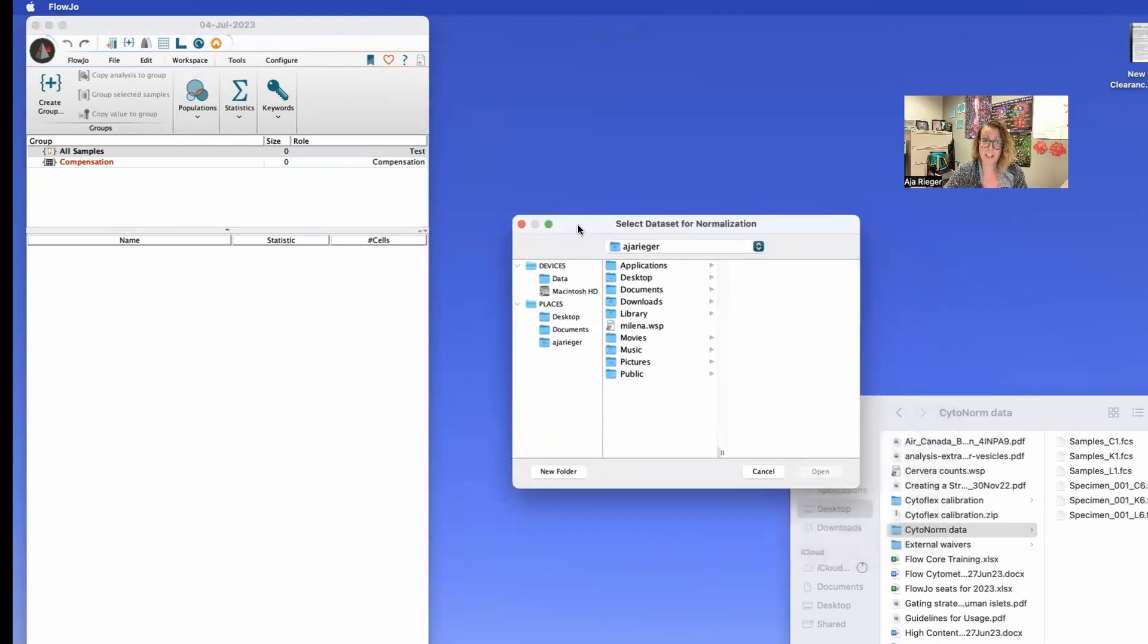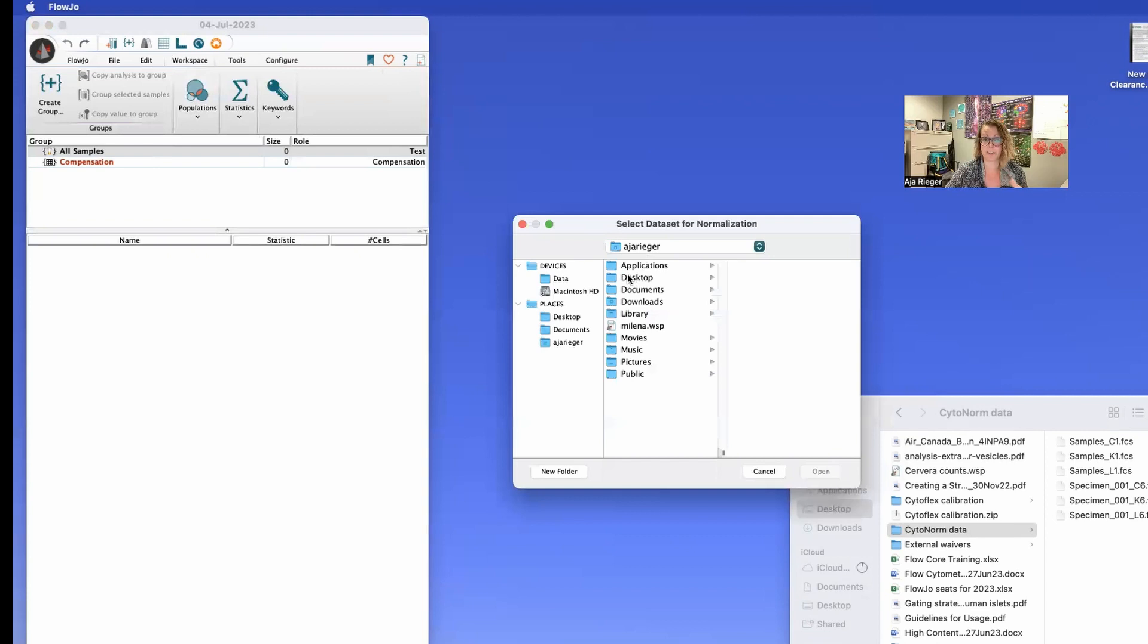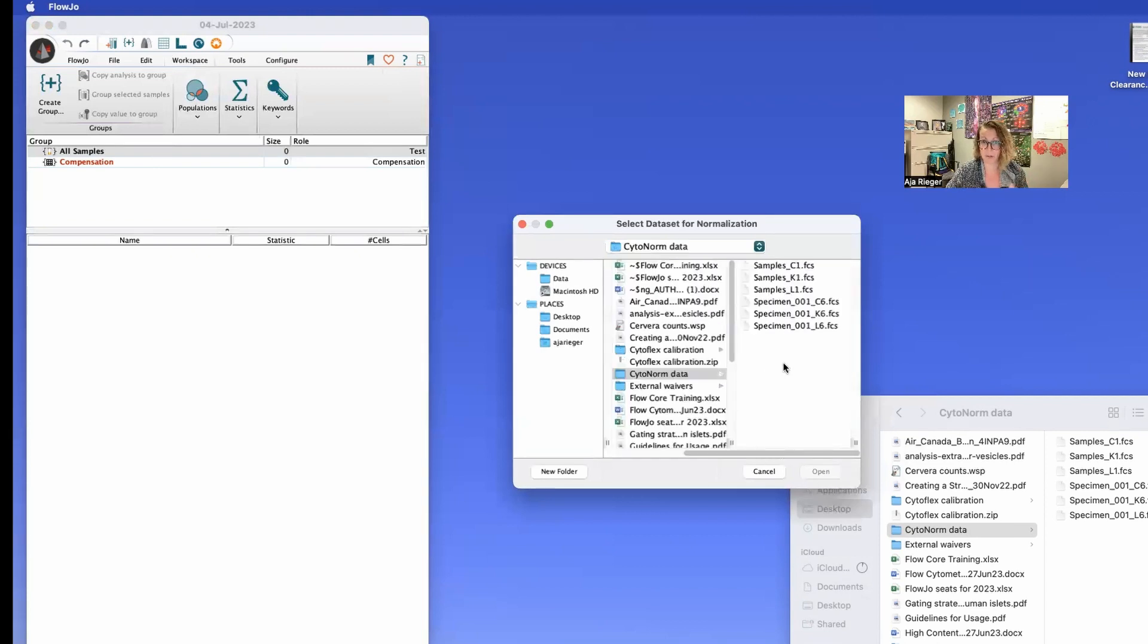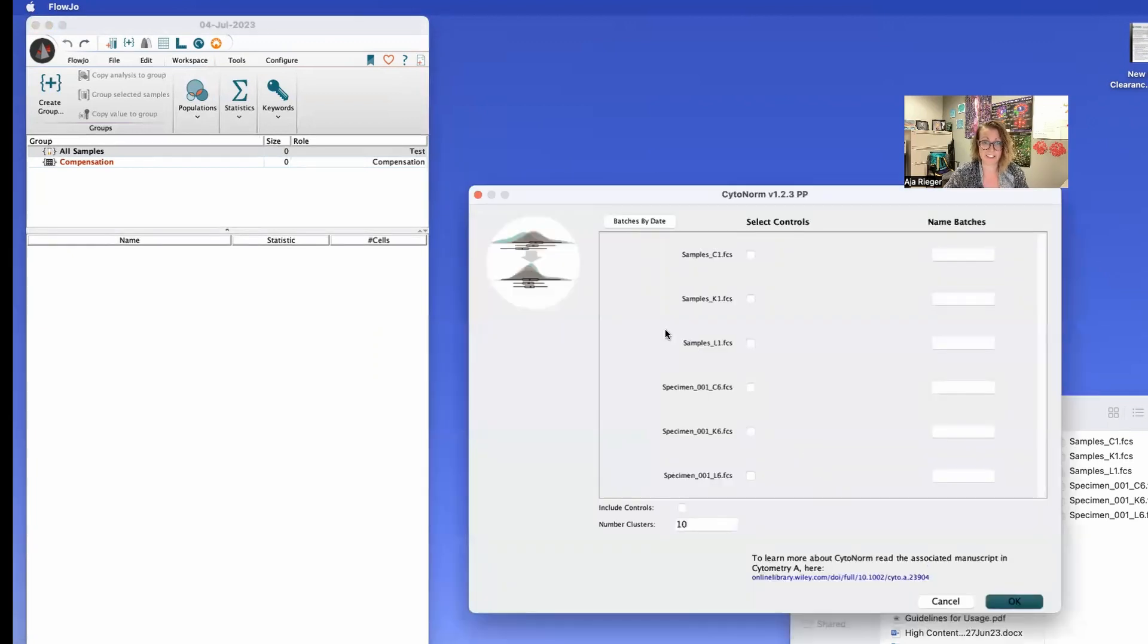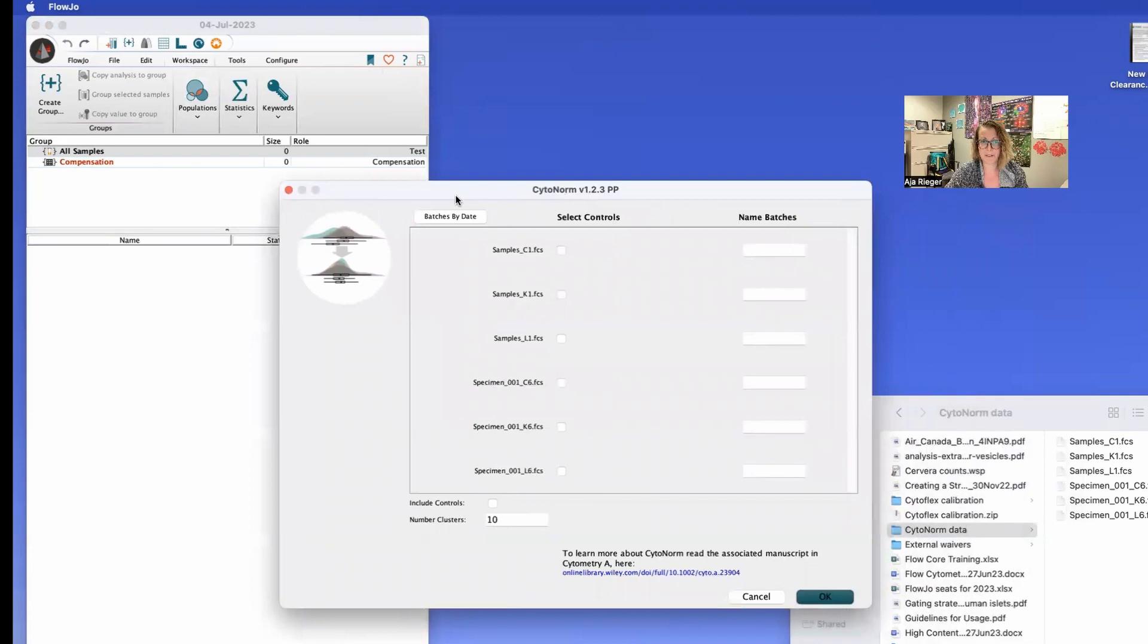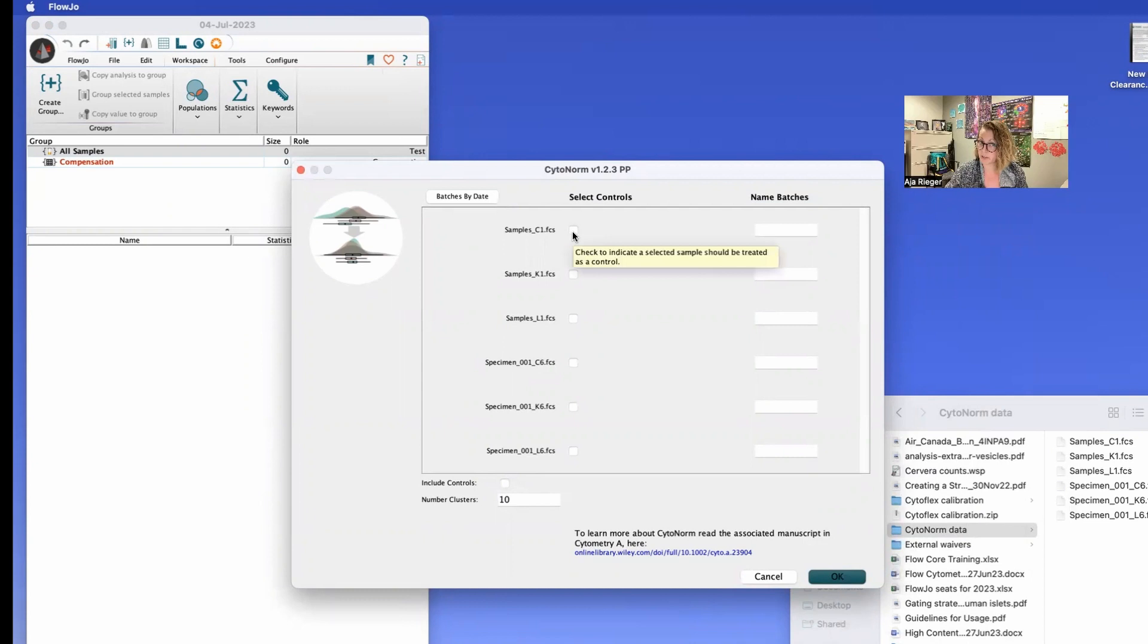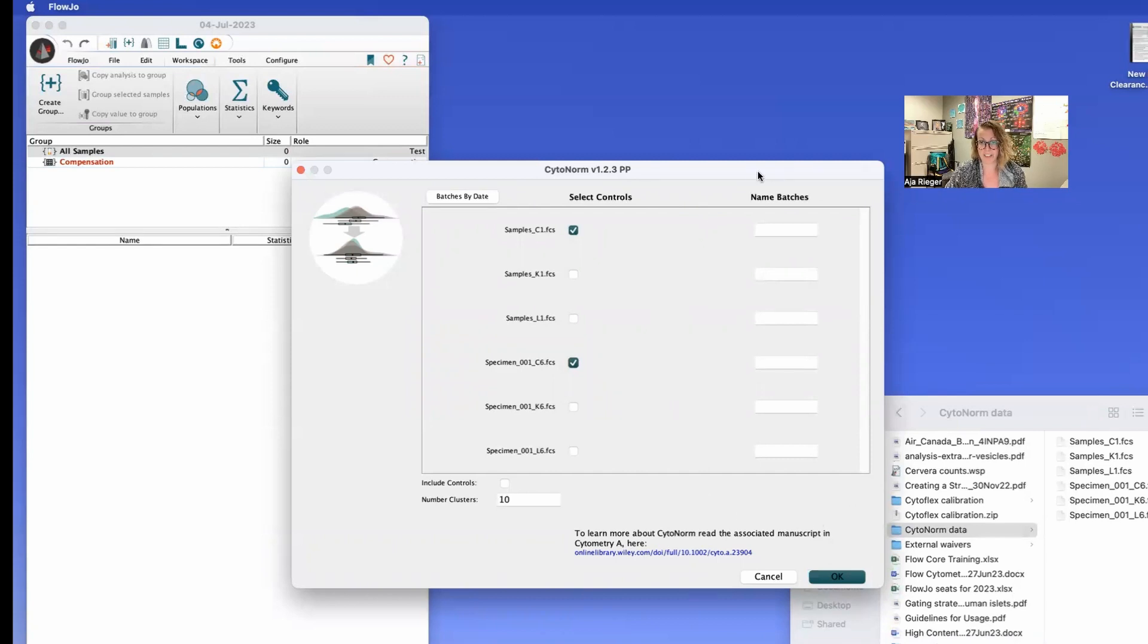And then from here you're going to go through and select what you want to use for normalization. So in here I have this folder set up for my Cytonorm data and I'm going to select that. So a couple things when you see this screen pop up. First off you're going to select your control samples. So I know that this is my C1 and my C6.